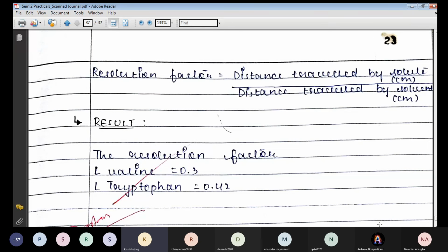Yes, we can, a large number, like 15 to 20 can be separated in one go by optimizing a proper solvent system, because there should be no tailing, no fronting. You will know what tailing and fronting are in your theory classes, but with that, 15 to 20 we can go in one go.